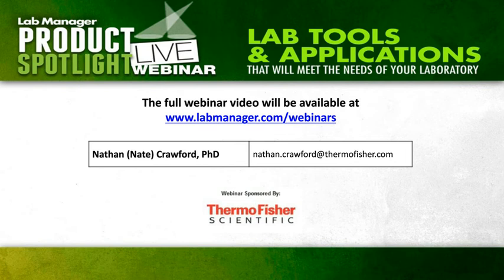And you can load those images or even a video into the software that will pop up and show that novice user as they're running a test how to properly transfer samples. And you can even have notes and messages built into that procedure. So you get to the point where you need to load the sample, actually have a message that pops up in that measuring procedure that says load the sample now, or trim the sample now, or clean the sample now.